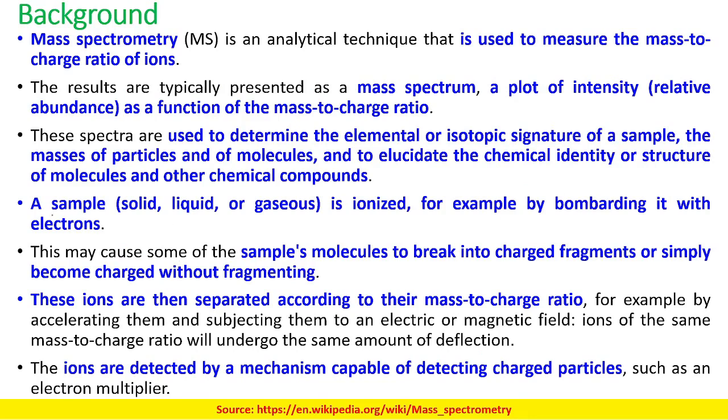The sample, you can use a solid sample, a liquid sample, or a gaseous sample. However, when the sample enters the ionization chamber, it has to be in the volatile form or the gaseous form. So if we are trying to analyze solid and liquid samples, you have to have a mechanism where you are volatilizing the sample.